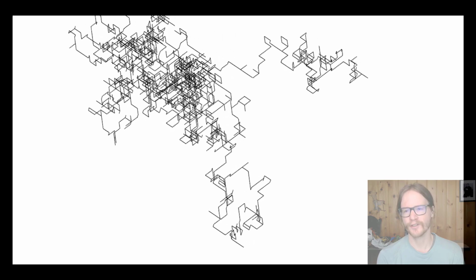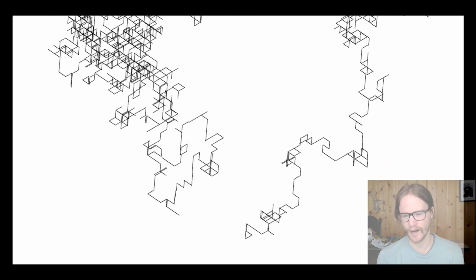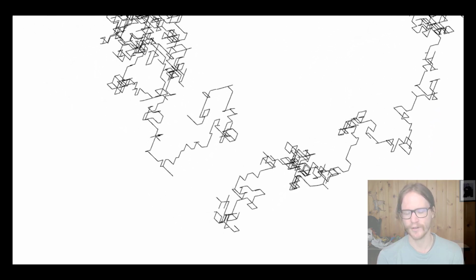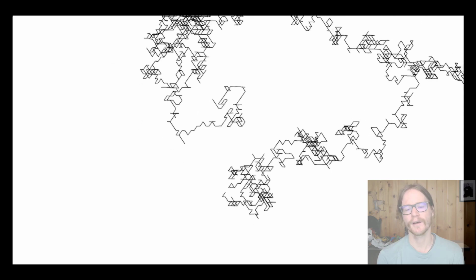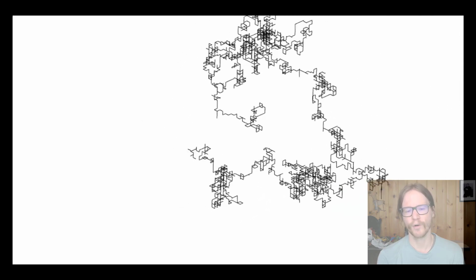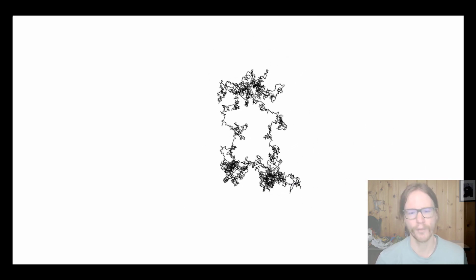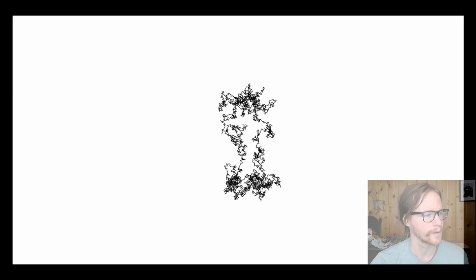Of course, these points are discretized, so the distance moved is finite and constant at each point, which gives it this geometric looking shape. But many things in the physical world behave in this sort of random walk or binomial distribution.